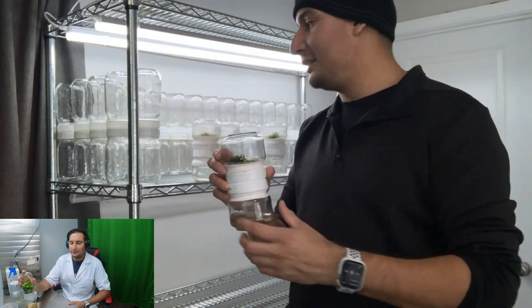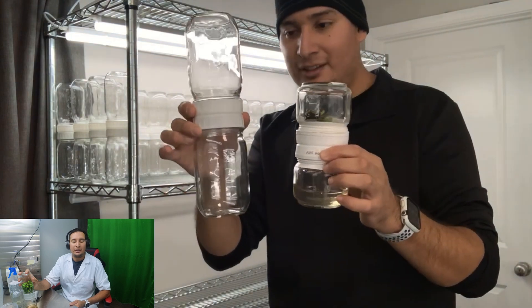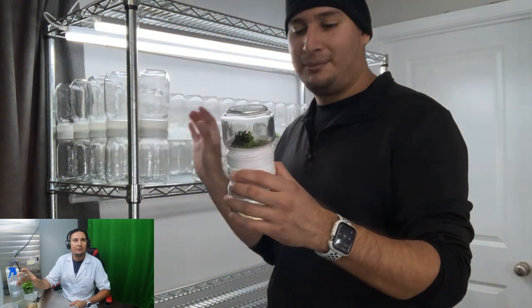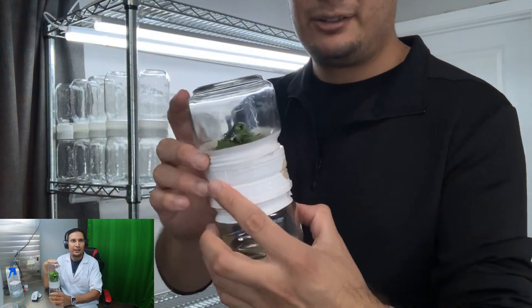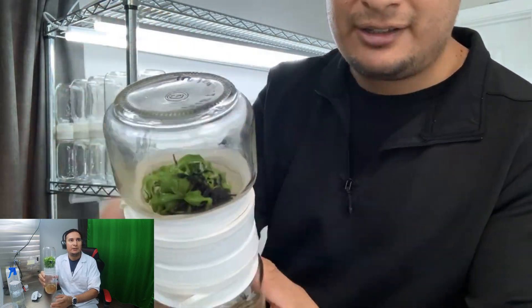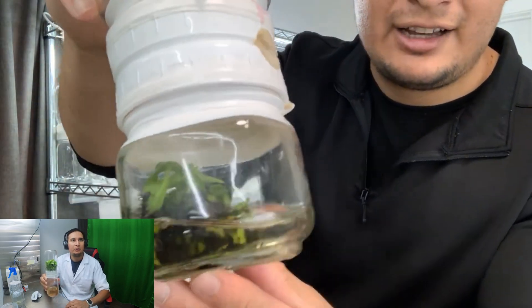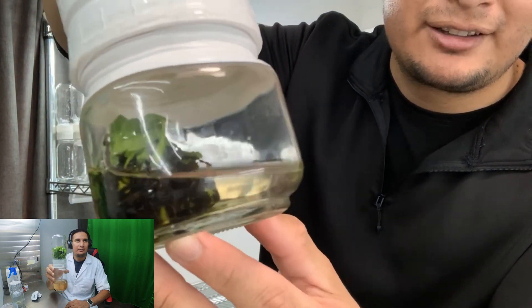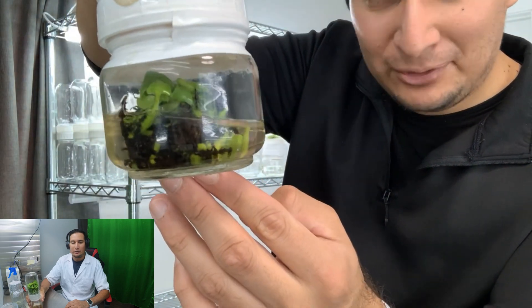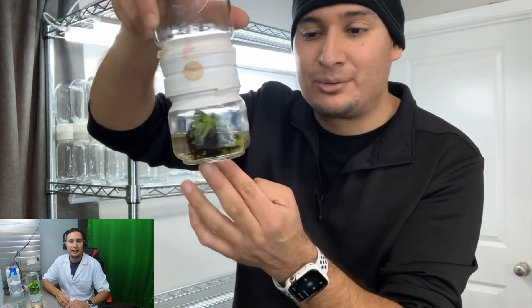This was early this year, back in February. Today we are in July, so only a few months ago. This is where I moved the plants from the 8-ounce to the 16-ounce container I have right here. You can see the massive difference — the plants weren't that big, but I still had good multiplication. Now it has more than tripled the amount of plants and size in just the last few months.